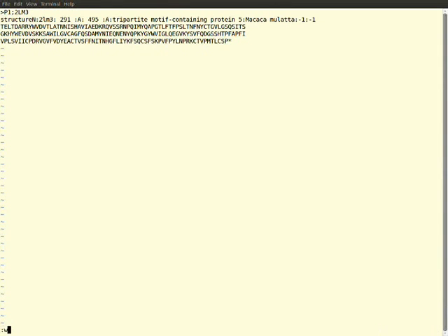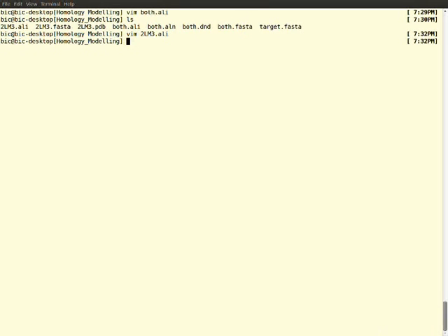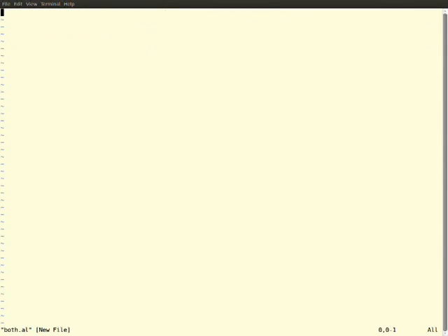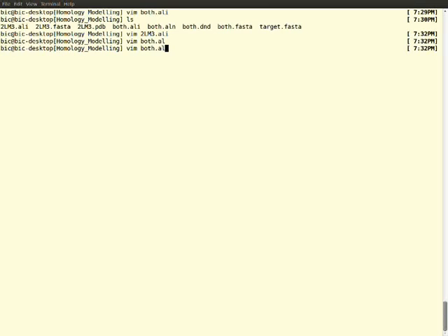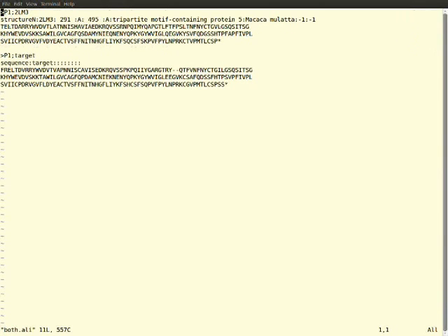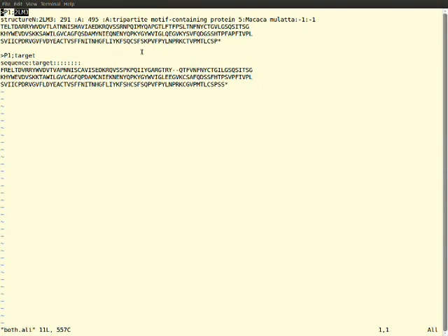I have generated, means I have converted, that both PIR into ALI format. Now we have generated an alignment of target and template. This alignment format is an input for our homology modeling MODELLER tool.